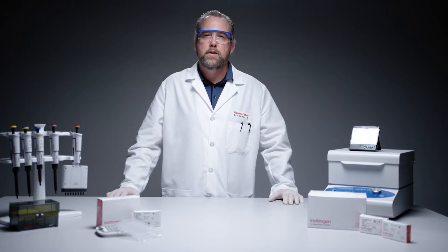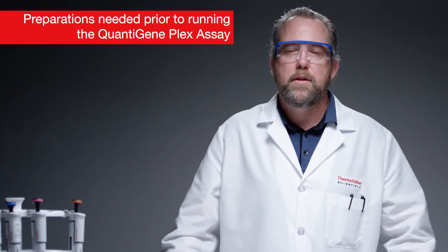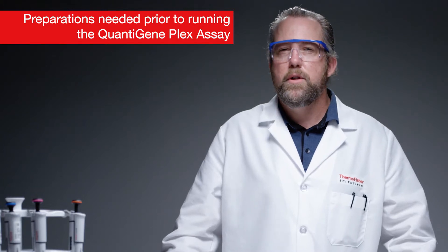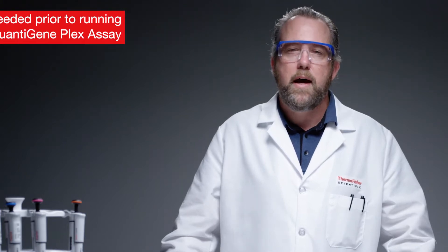In this video, we'll show you how to set up and run an Invitrogen Quantigene Plex assay in a 96-well plate format. The demonstration of this assay will be using cell lysates. Please refer to the other how-to videos for sample preparation and data analysis for Quantigene Plex assays.